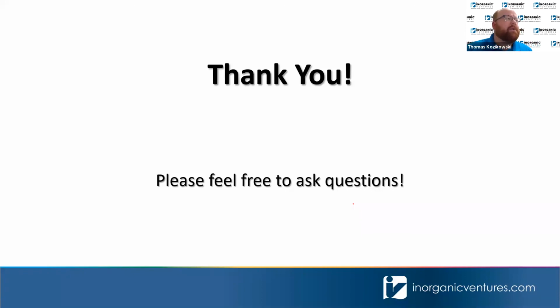I don't know if Mike, you wanted to add anything to that. Yeah, I would say that's an excellent answer. We do a lot of our workup offline in our own spreadsheets because, as Thomas had mentioned, it is a black box, but also every sample is getting monitored at close to 400 different lines. So it's a lot of data to crunch together.